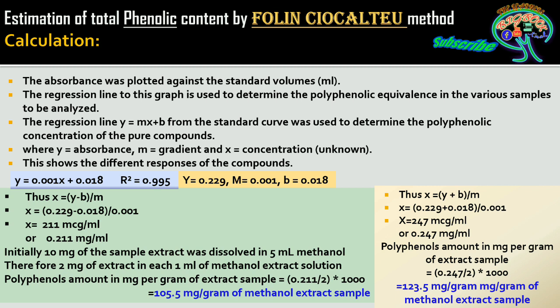What I want to say is that, among colorimetric methods, the Folin-Ciocalteu reagent method is the best one, and it has to be a specific method of calculation considered universally, so that we can be confident of getting results on the appropriate track rather than by choice.